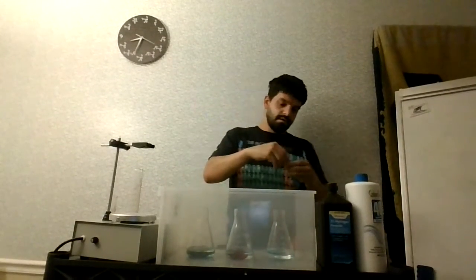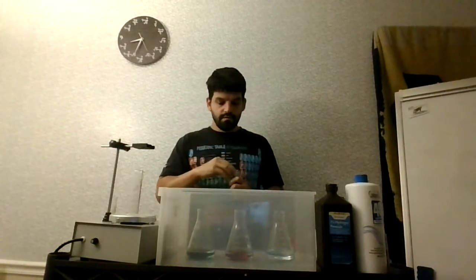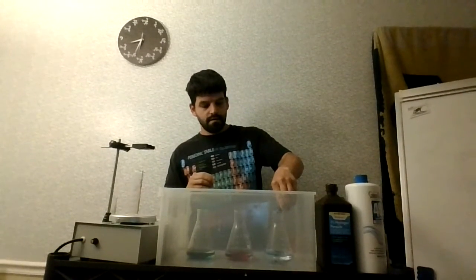Okay. And then in our last one, we have the 40 volume. Oh, okay. Made a mistake there. Hold on. Sorry about that. This is going to be the 3% hydrogen peroxide solution with the active dry yeast. This one is going to be the 40 volume hydrogen peroxide with the active dry yeast, and this one is going to be the 40 volume solution of hydrogen peroxide with the potassium iodide catalyst.